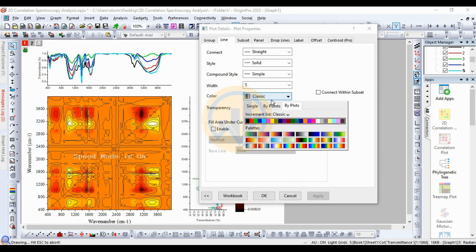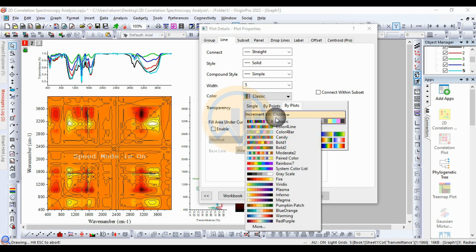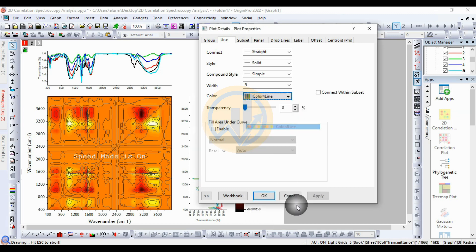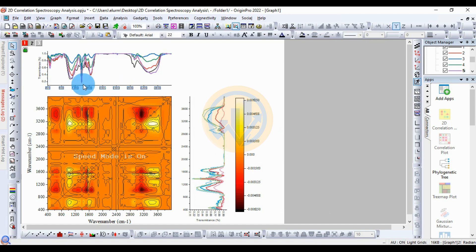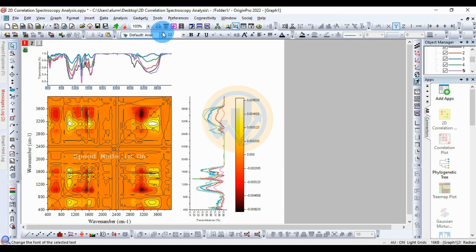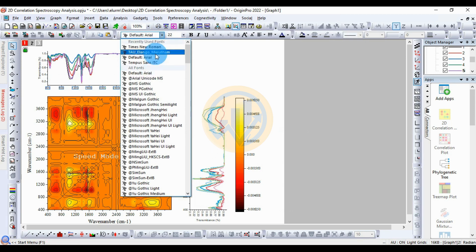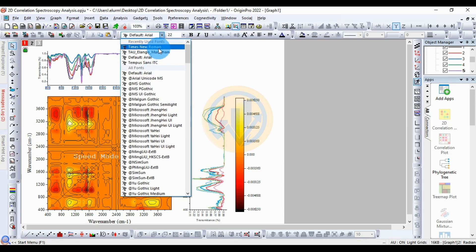Apply the color change. Also apply the same edits for the wave number labels — change the font size and font name accordingly.